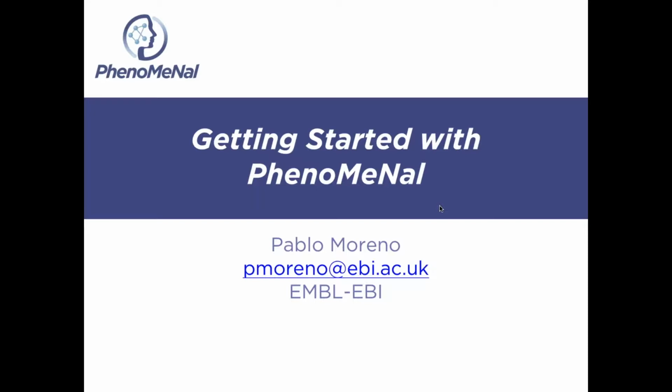I'll give you a general overview of PhenoMeNal, and I'll give you a short demo of how you can use our ability to deploy a metabolomics data analysis infrastructure to a cloud provider. I hope you very much enjoy the demo. I will give some links as well to where you can find the instructions to follow the demo on your own time, so you can try to reproduce this, and also to be able to get an account in our public instance.